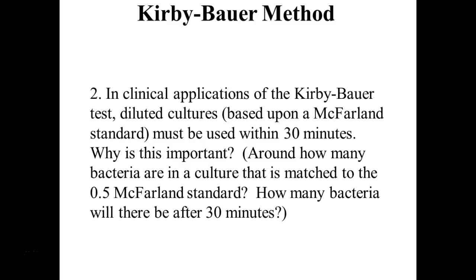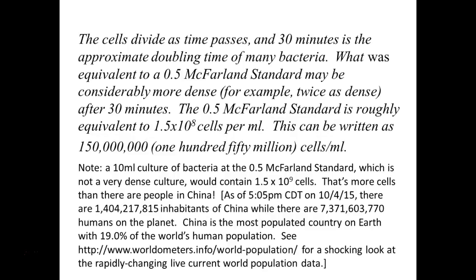They're in the tube, they've got food, they could grow. Do we want them to grow? No, because we want around the same number of bacteria on all our plates. So you have to use it within a certain time frame. 30 minutes is the general rule. Anything past that, you pitch it and start over.